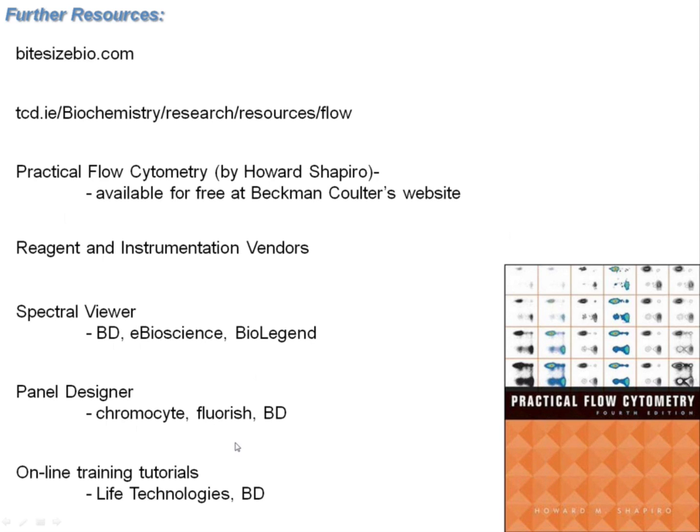And then there are various more basic training tutorials, not just in cytokine staining but also basic flow tutorials such as Life Technologies and BD.